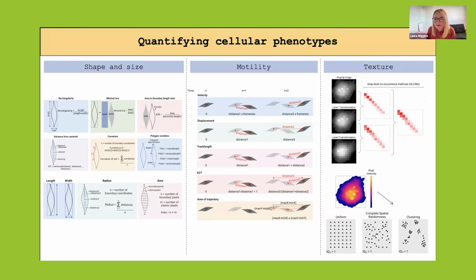And what we found that really useful for is being able to detect the cells that have these pixelated high intensities of clusters in the middle that you can see in that original image, and separating those from cells that perhaps are more uniform within their cell interior. We've also got a similar metric to that, which looks at pixel intensities and compares them to a spatial point process. Again, able to detect clustering of pixel intensities on different percentiles of intensity value.